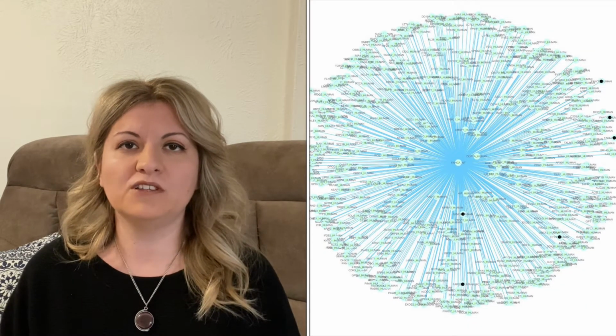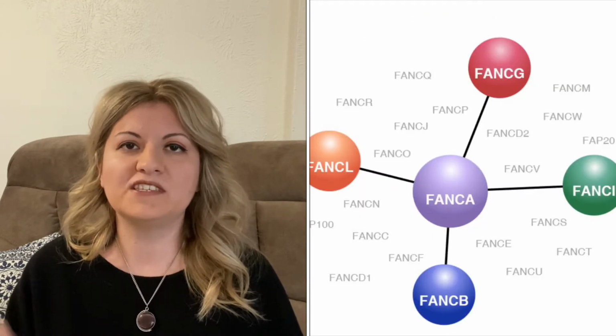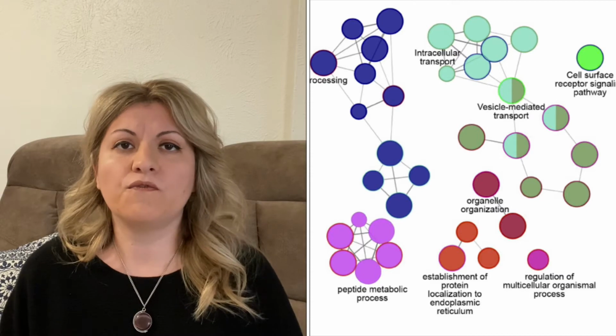Interactome is the whole set of physical interactions between molecules. In this case, it's going to be protein-protein interactions. In the simplest words, these proteins form a network. The network of proteins can be looked at on a big scale, meaning within the whole cell, or we can target specific pathways and look into how that network changes during different phases, metabolic processes, and different pathological processes.